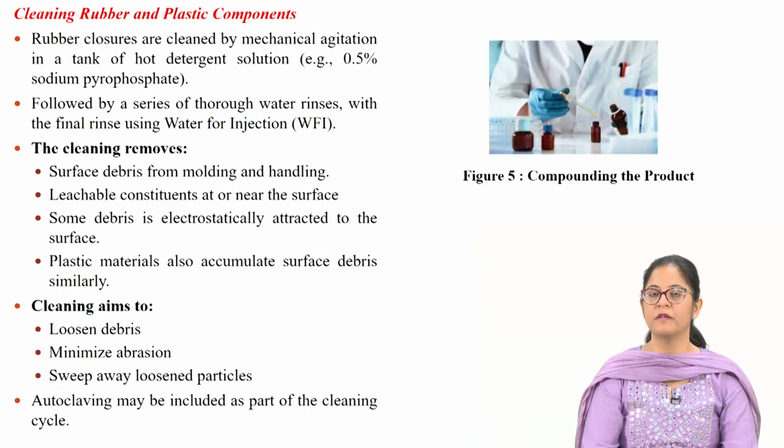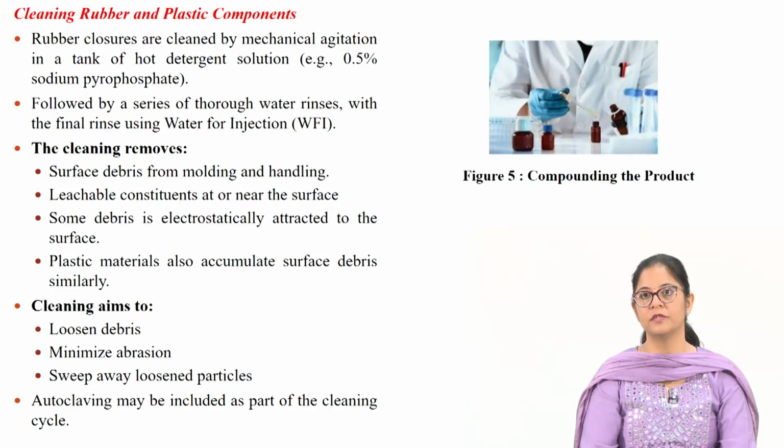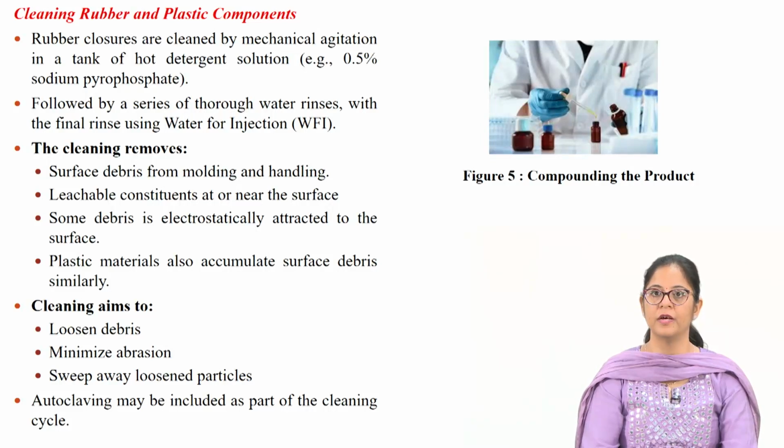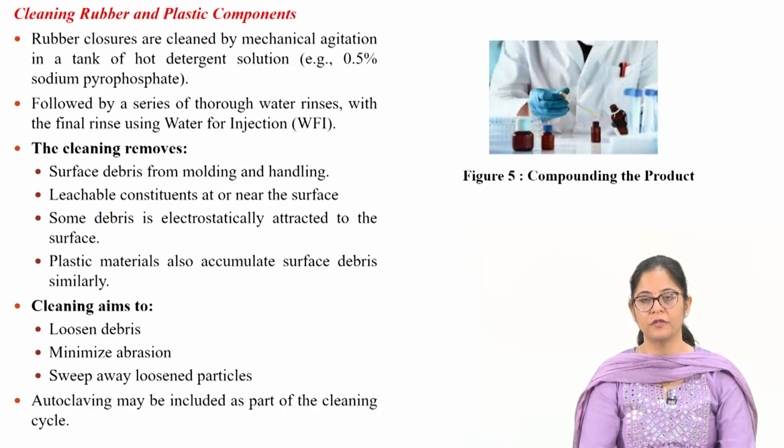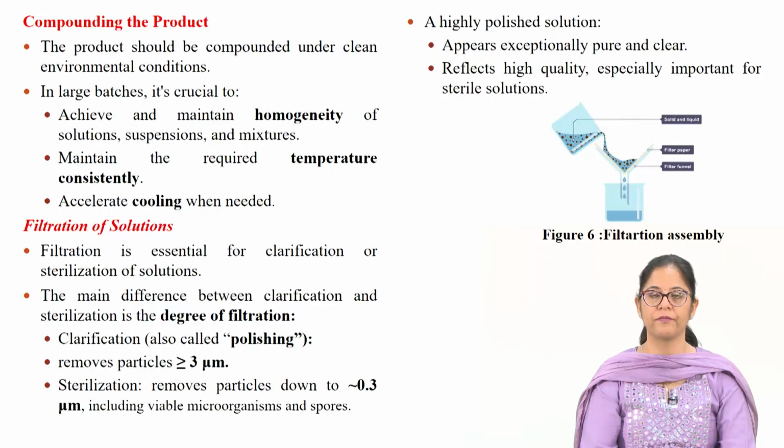Some debris is electrostatically attracted to the surface. Plastic materials also accumulate surface debris similarly. Cleaning aims to loosen the debris, minimize abrasion, and sweep away loosened particles. Autoclaving may be included as a part of the cleaning cycle.